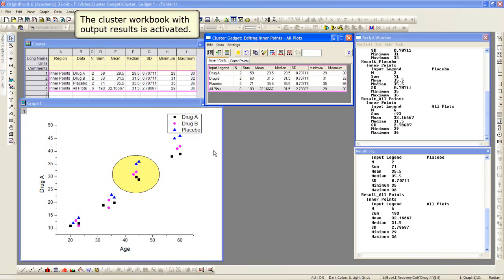You can compare the results in the cluster workbook to the values that you see in the cluster gadget dialog.